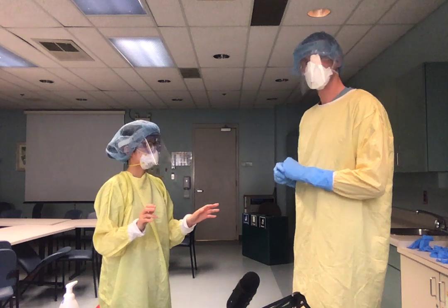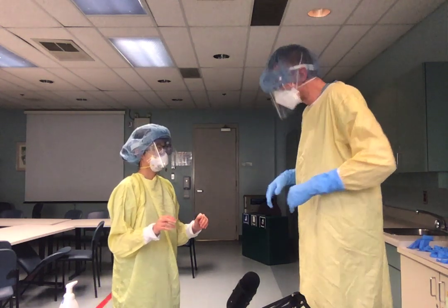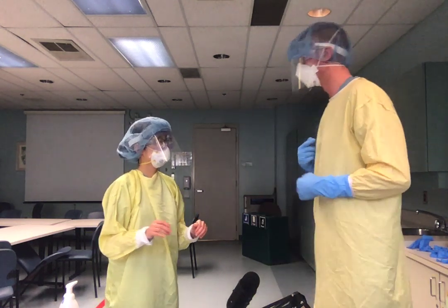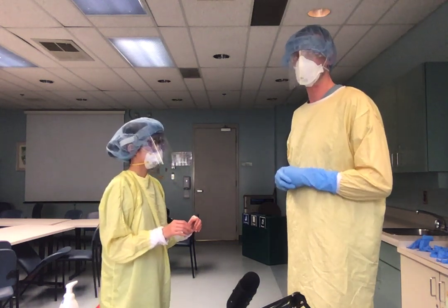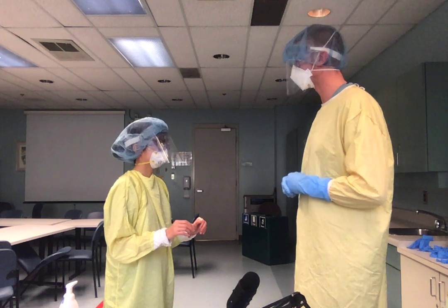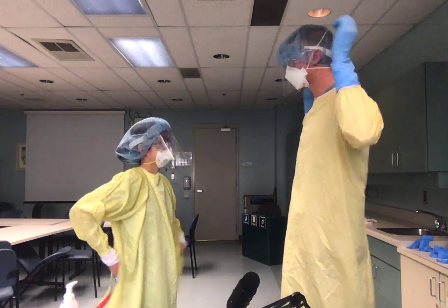Okay? So the next thing we're going to do is take off the gown. Nancy, this is very important. You'll see often people with limited shoulder mobility end up with their chin on their chest as they're reaching here. That's not good because your chin is touching a very contaminated area of your gown. So a cue that I like to use as a doffing supervisor, sometimes we call it the dofficer, is to cue the person who's doffing to stare into my eyes while they take their gown off. We're going to do the waist first, just like you're doing. And then we're going to reach up and do the neck.